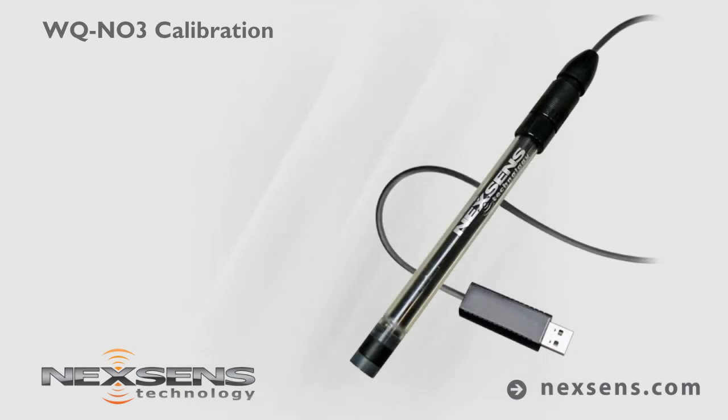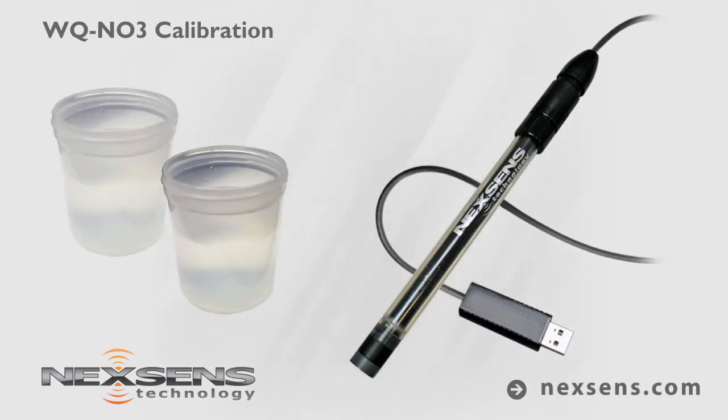Calibration and measurements with the NexSense WQ Nitrate sensor are quick, easy, and reliable. The software supports a two-point calibration, which is typically performed above and below the expected measurement range. For this demonstration, the sensor will be calibrated using 10 and 100 parts per million standards.